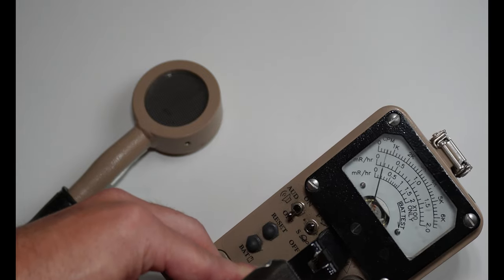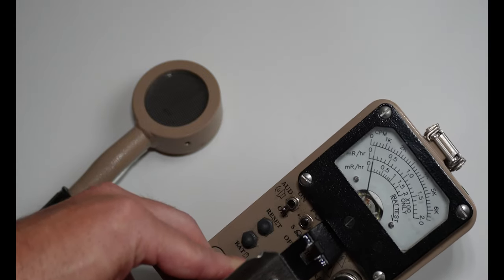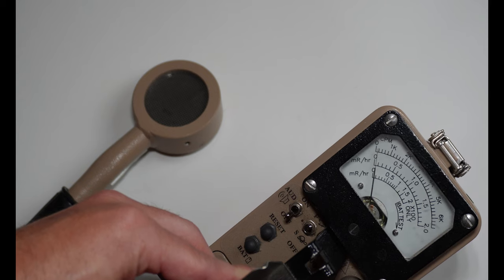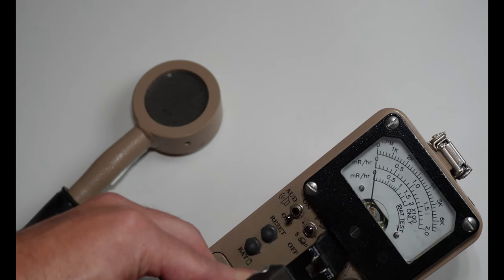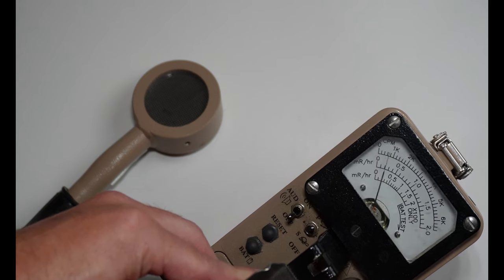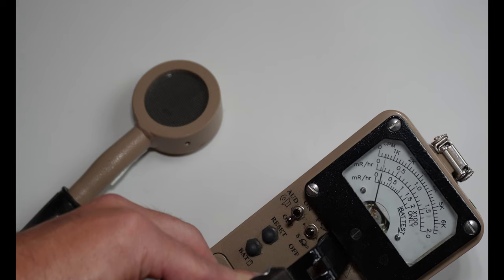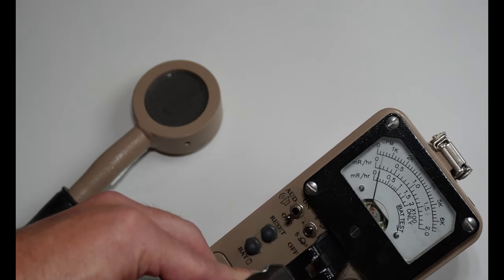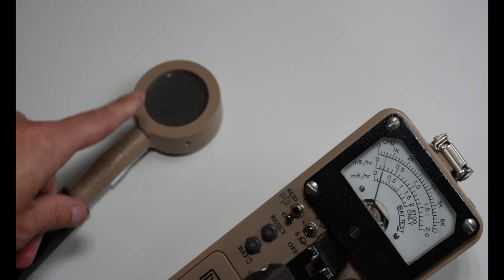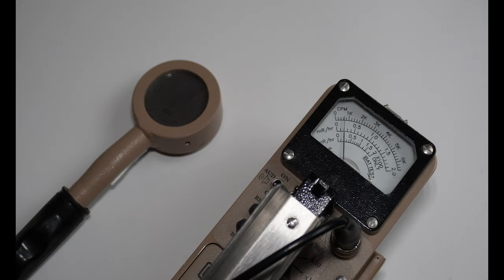Counts per minute is going to be used mostly for analyzing wipe tests, or looking for any kind of removable contamination. And oftentimes you're going to need to convert from counts per minute to disintegrations per minute using a known efficiency for your detector. That known efficiency may come from the manufacturer, or it could also be measured using known radioactive sources by your physicist.